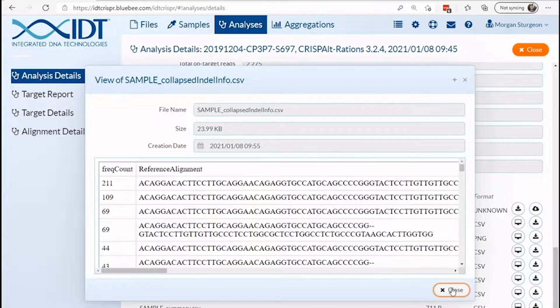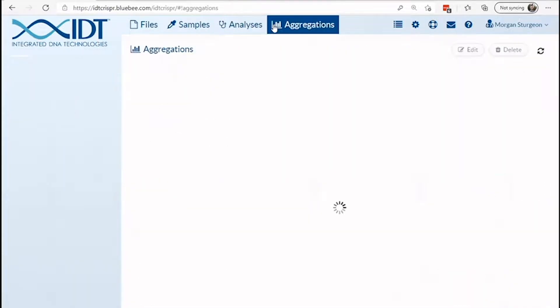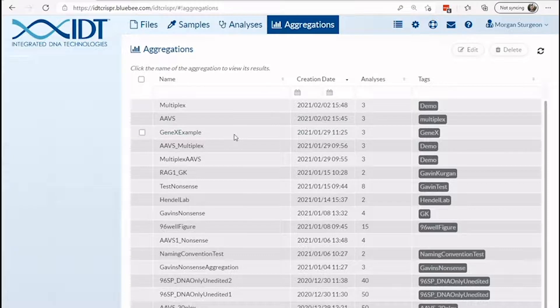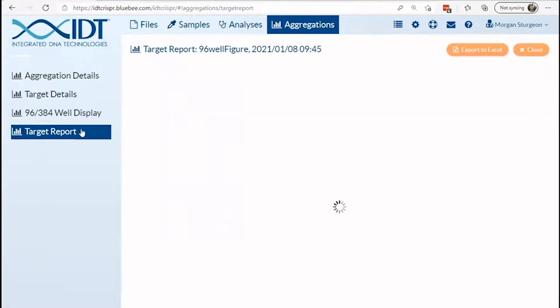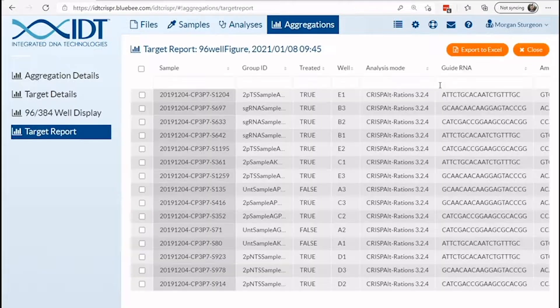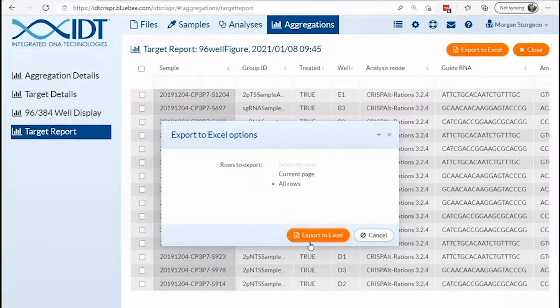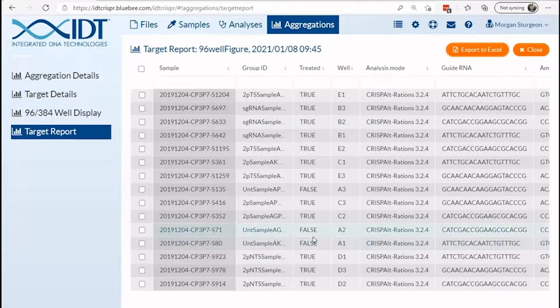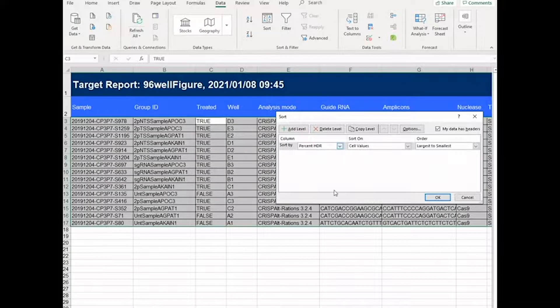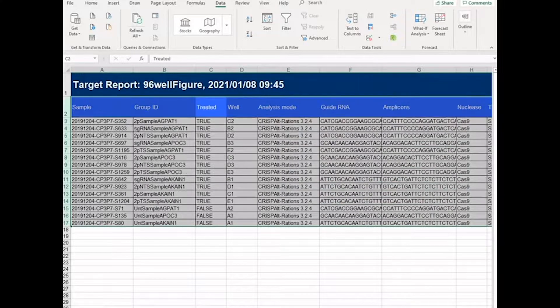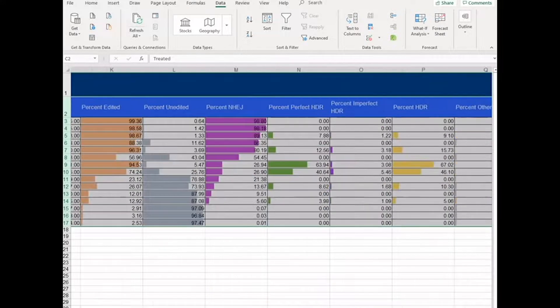To interpret and compare results of different samples within an experiment, navigate to the aggregations tab. Here on the target report landing page, you can view all samples that were aggregated for summarization, then easily export this information to Excel. From here, you can quickly sort and/or filter experimental results as needed and render additional graphics in your software of choice.